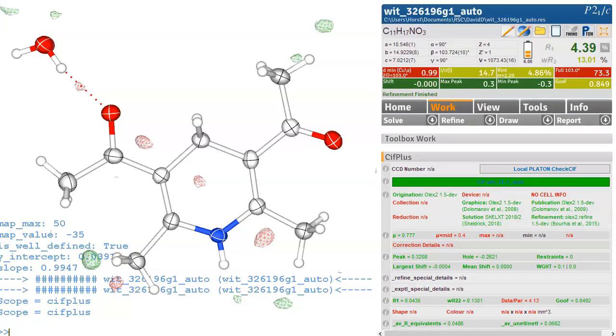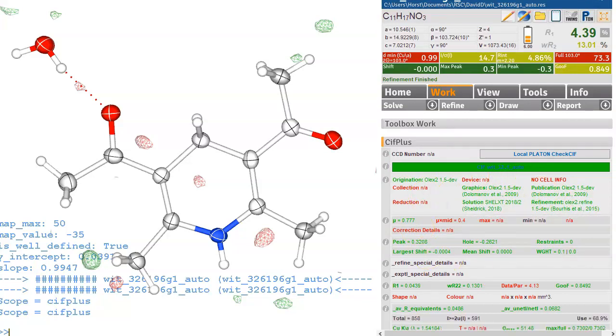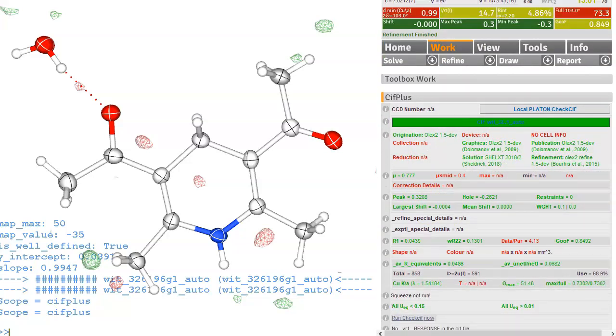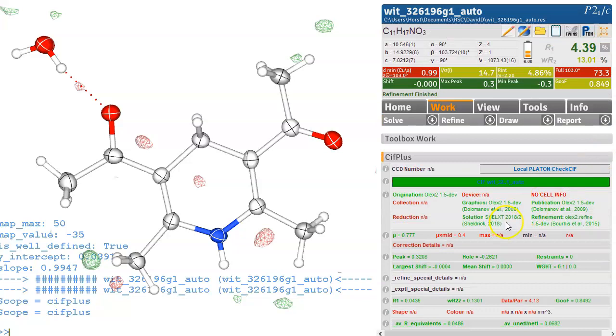Now if you start with the CIF OD file in place like if you start in the folder that the diffractometer gave you and don't move any files out just copy that whole folder and work in that folder then Olex2 normally extracts all the information that's required to get a clean CIF that's ready to be published so there's a lot of stuff missing here.